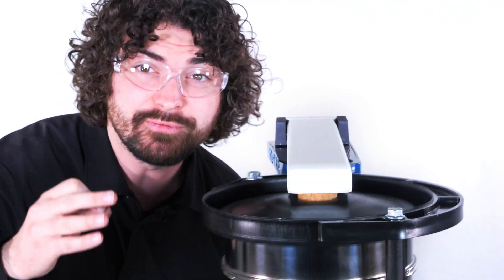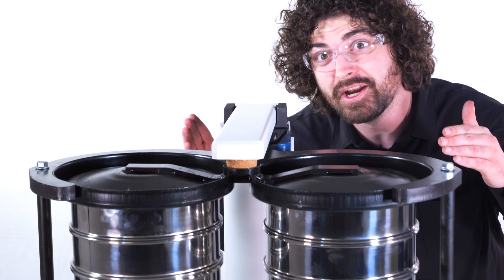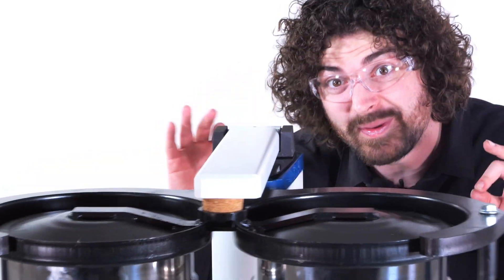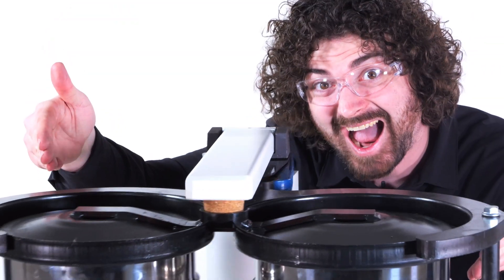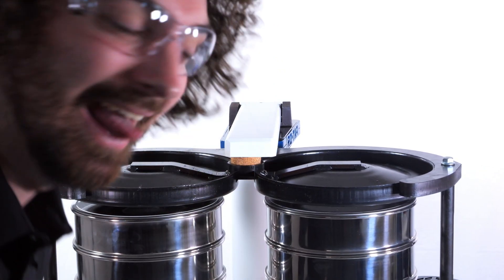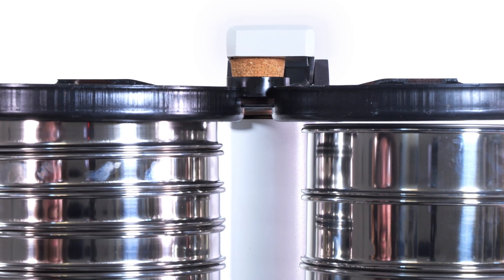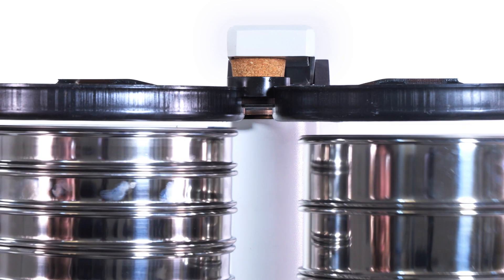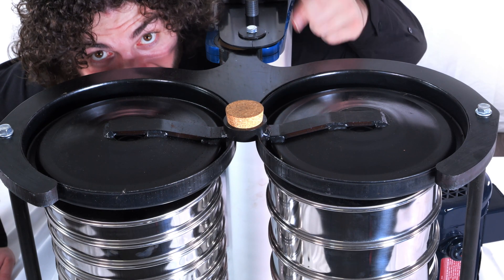Two things to keep in mind. If you're switching from a single sieve stack shaker to an RX94, you should definitely run another end-of-sieving analysis, because the two stacks only use one hammer to distribute the power through both stacks. The second thing is that both sieve stacks have to use the same sieve sizes — you can't have full height sieves on one side and half height sieves on the other, because both sieve stack covers are connected and have to be even.